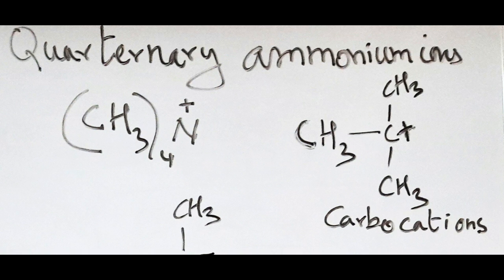So the 12 protons of tetramethylsilane experience a higher shielding effect. So as a result, the chemical shift value will be the lowest and it is assumed as 0. When compared to the organic molecule, the frequency of absorption will be the lowest for tetramethylsilane. So the frequency of absorption is assumed as 0 for the reference compound.